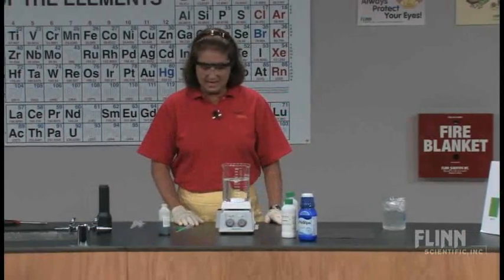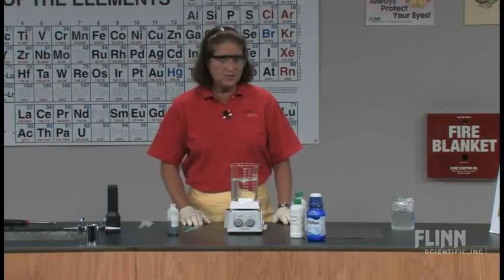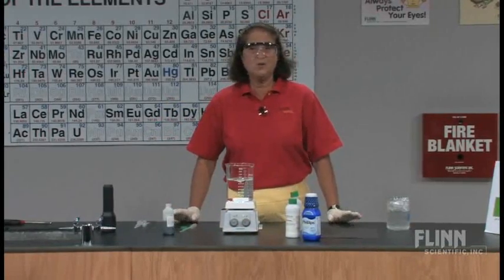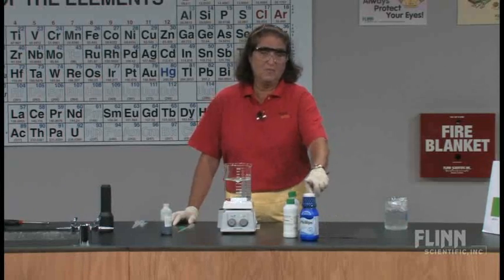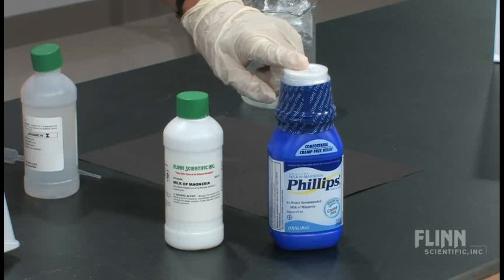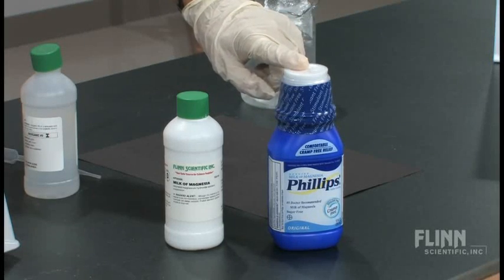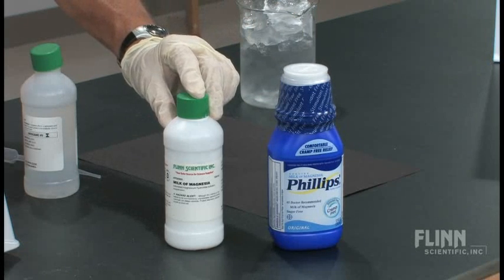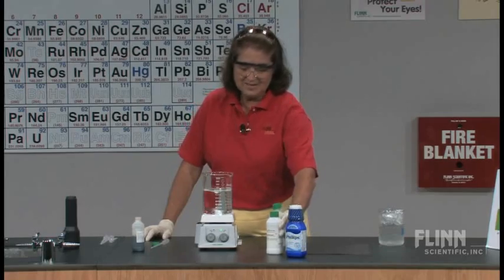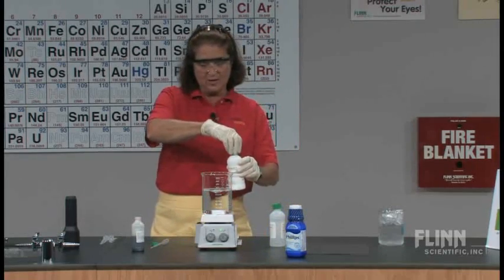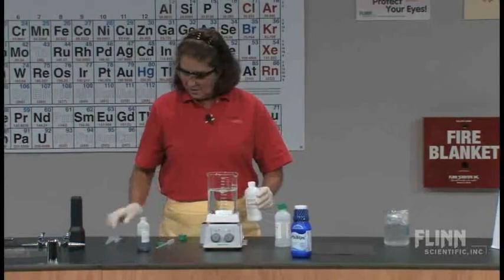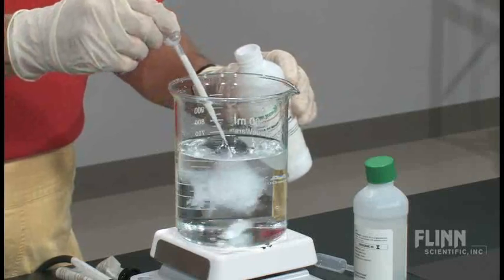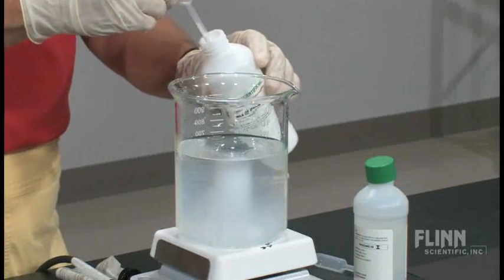I'm starting with some distilled deionized water, and what I'm going to do is add a common household chemical. You can buy it at the grocery store — I'd pick up a bottle of Phillips Milk of Magnesia. The active ingredient that I'm interested in is magnesium hydroxide. I've got some water here on the stirring plate, and I'm going to start by just putting in a couple of milliliters of the magnesium hydroxide.